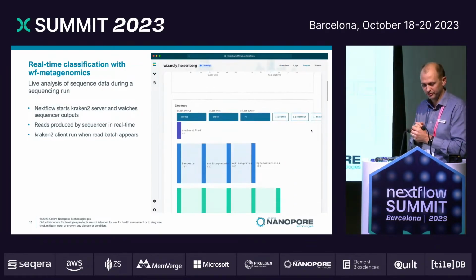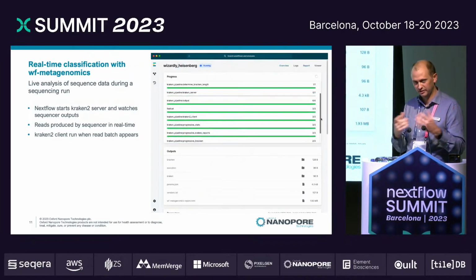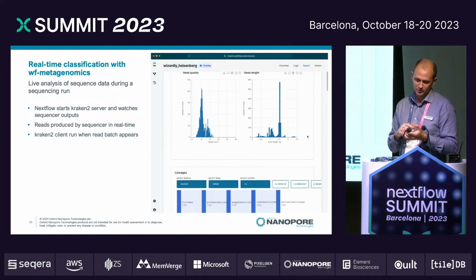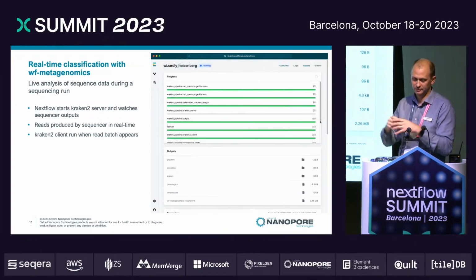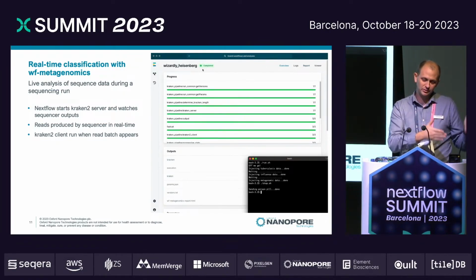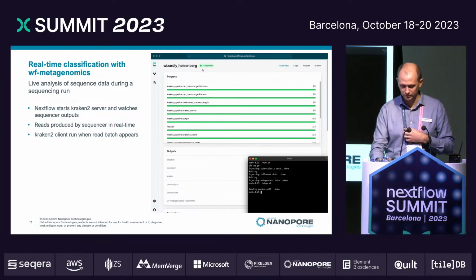We generate a report just from those. Finally, the flu reads come through the system. We can generate a report from the TB and the flu. And then that larger community eventually comes through as well. And we get our final report of all of these species. So we're progressively creating a larger and larger data set. We haven't waited for all of the sequencing to finish before we started doing this. This is obviously only a toy example.